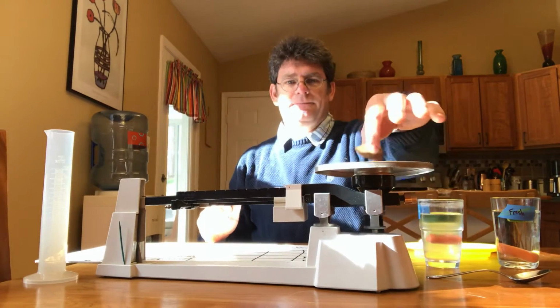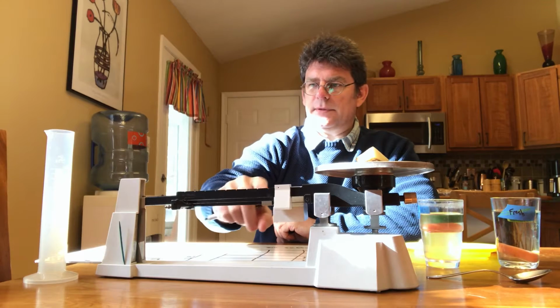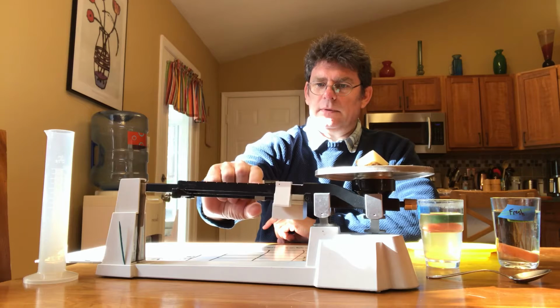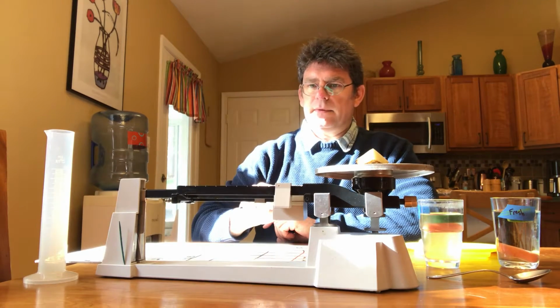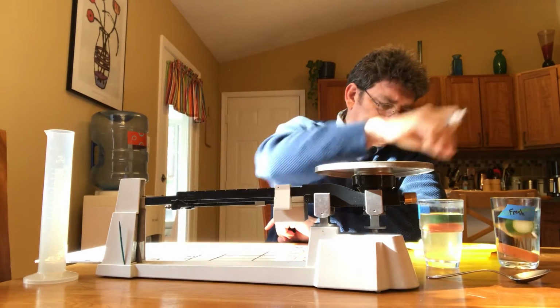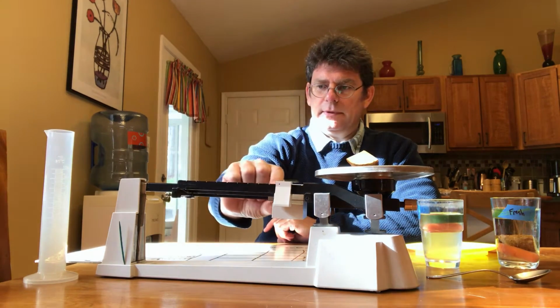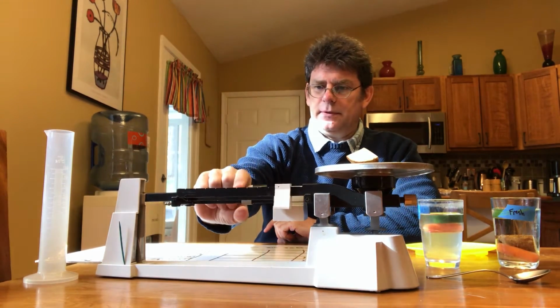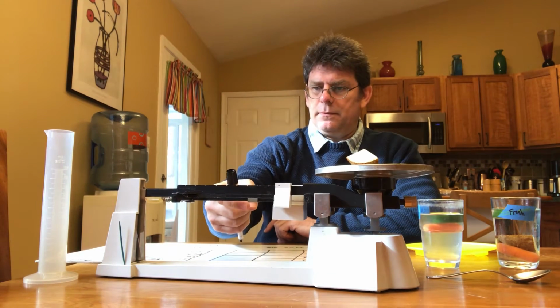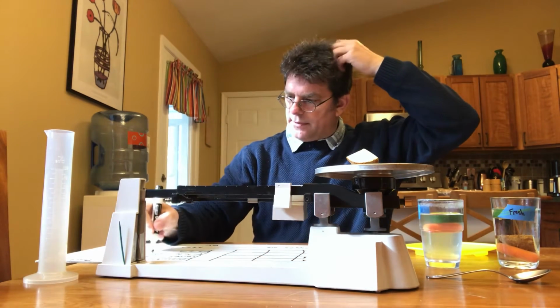A piece of potato. All right. This first piece looks like it's right at 14 grams. I'll put that in my fresh cup. And my second potato, a little heavier. That's 14.6 for that one. I'll put that in the salt.